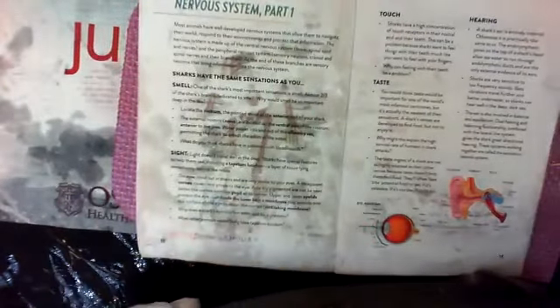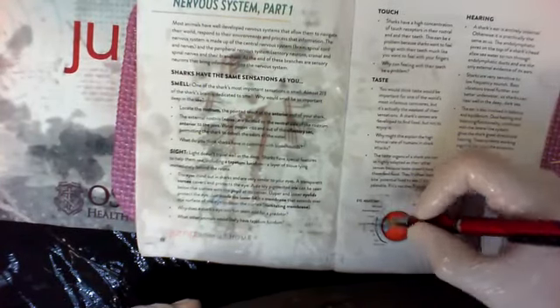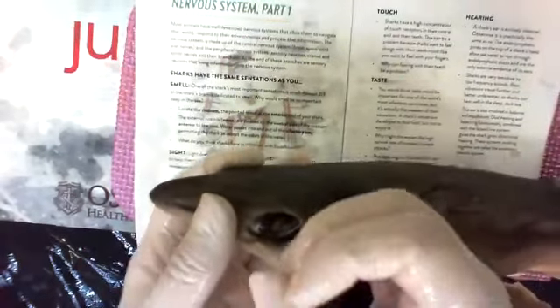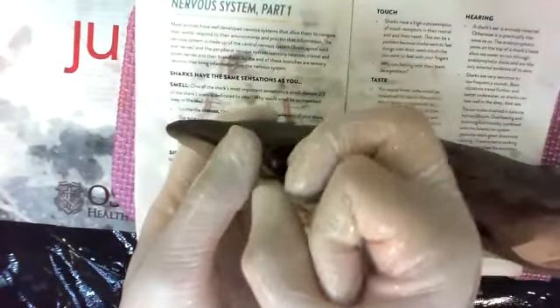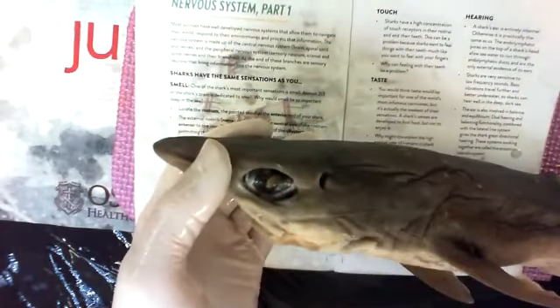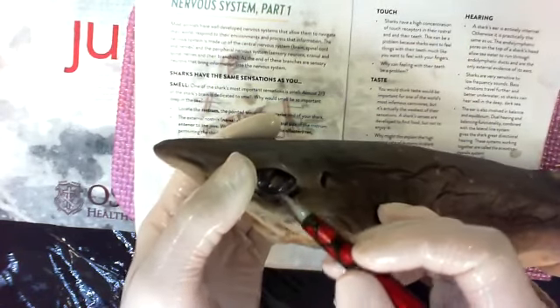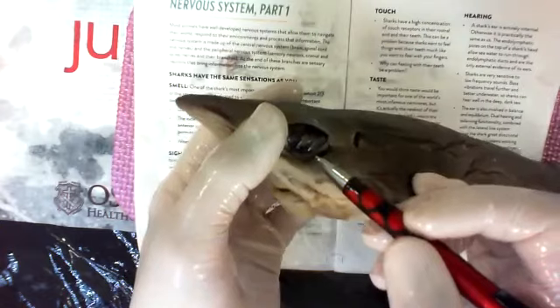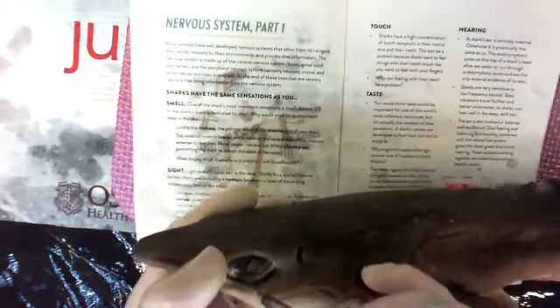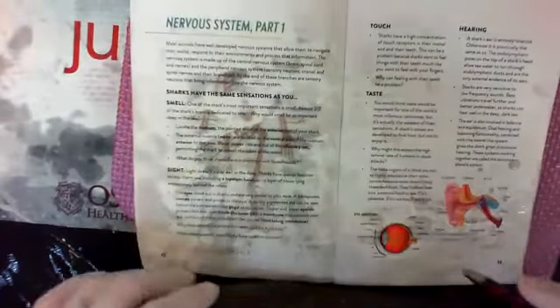But a shark does. Another thing, in the eyeball, you have an iris and a pupil. The pupil can dilate and constrict. Dilate means to open up and get big. Constrict means to squeeze down. But it has a pupil and iris just like people do. So, in other words, the shark can adjust to the light close to the surface of the ocean, but it can also adjust to the darkness down in the deep parts of the ocean. Kind of weird.